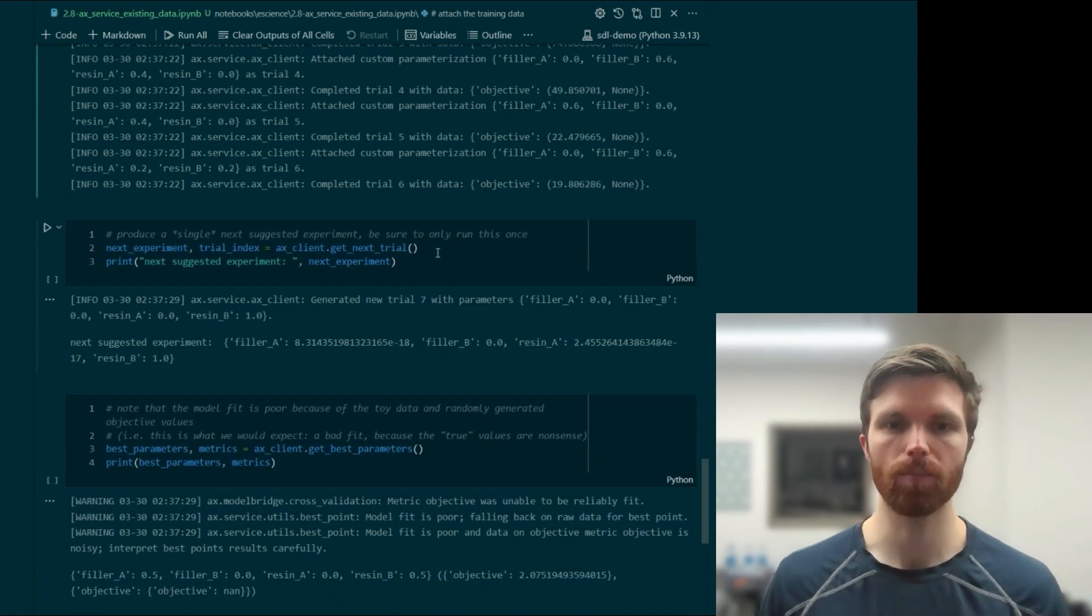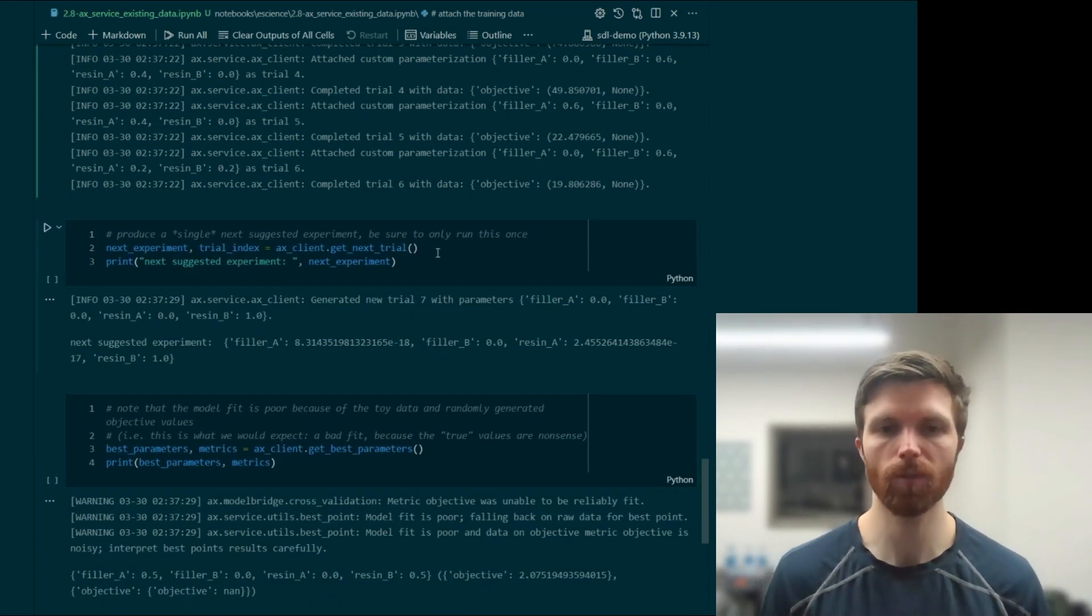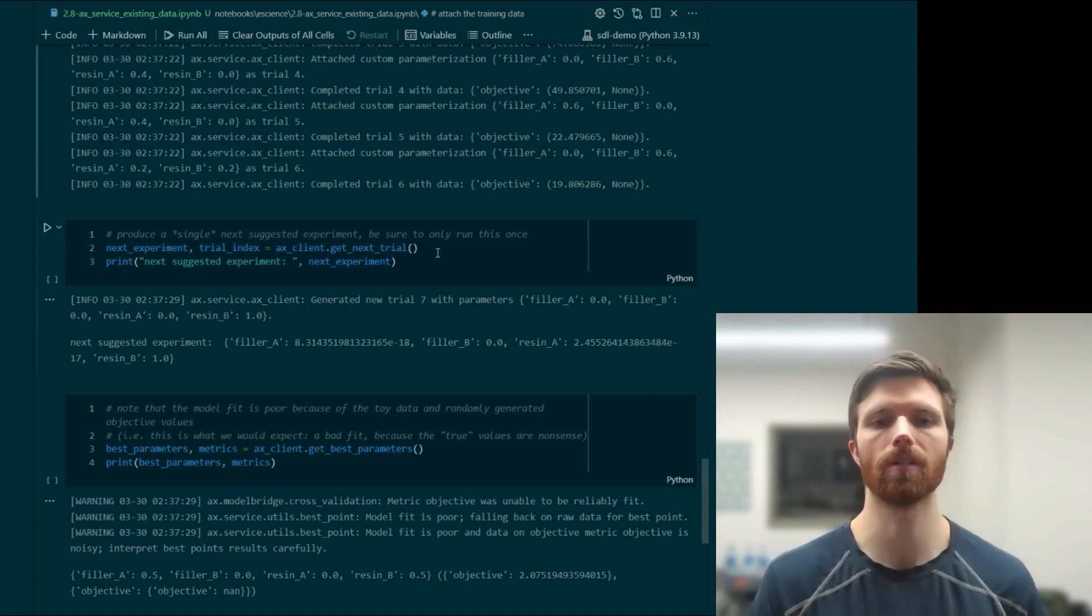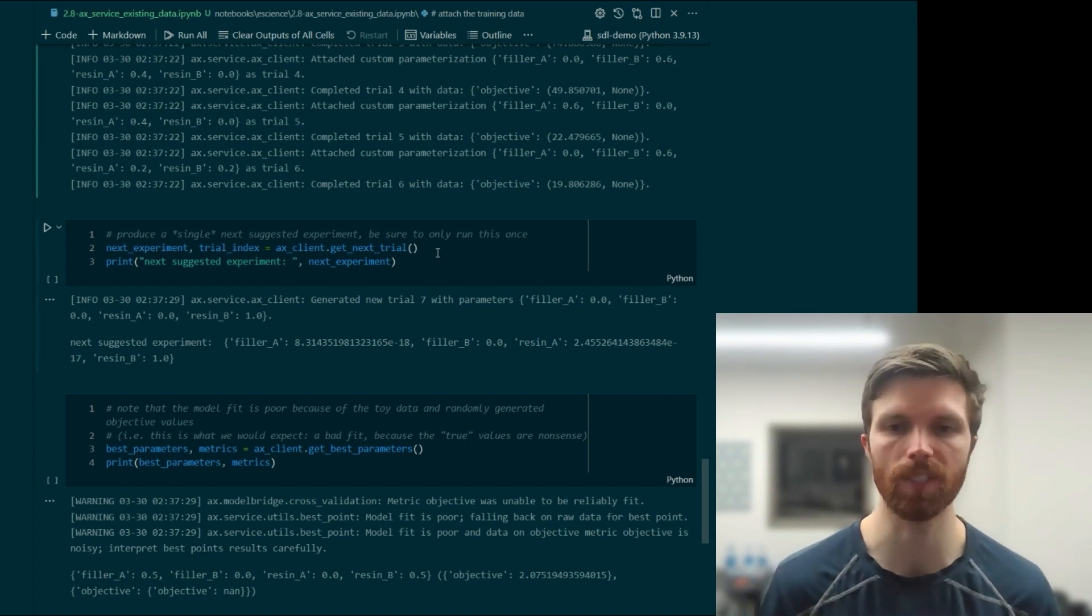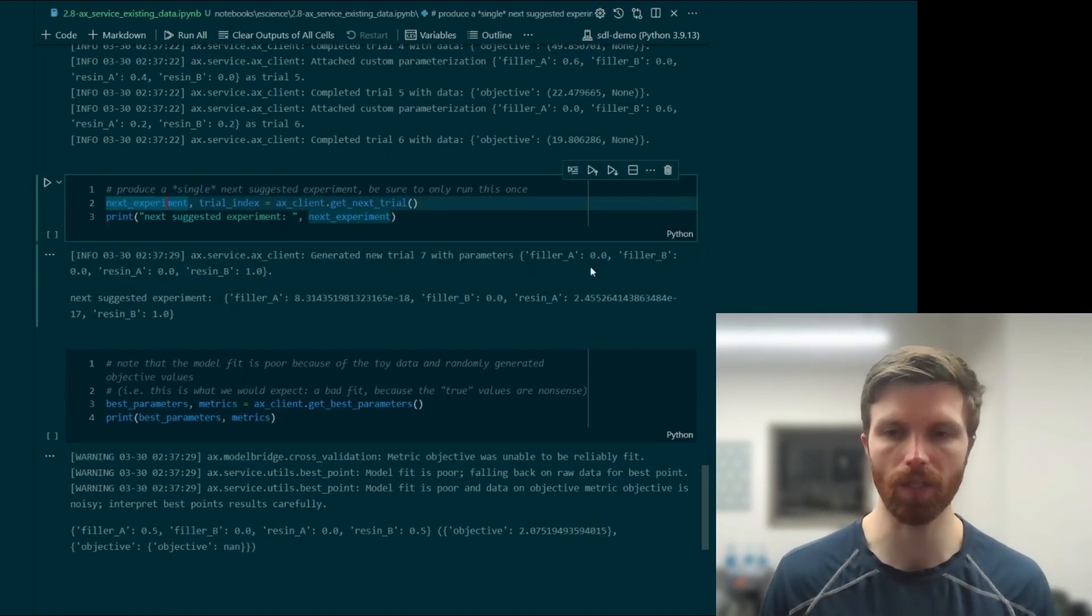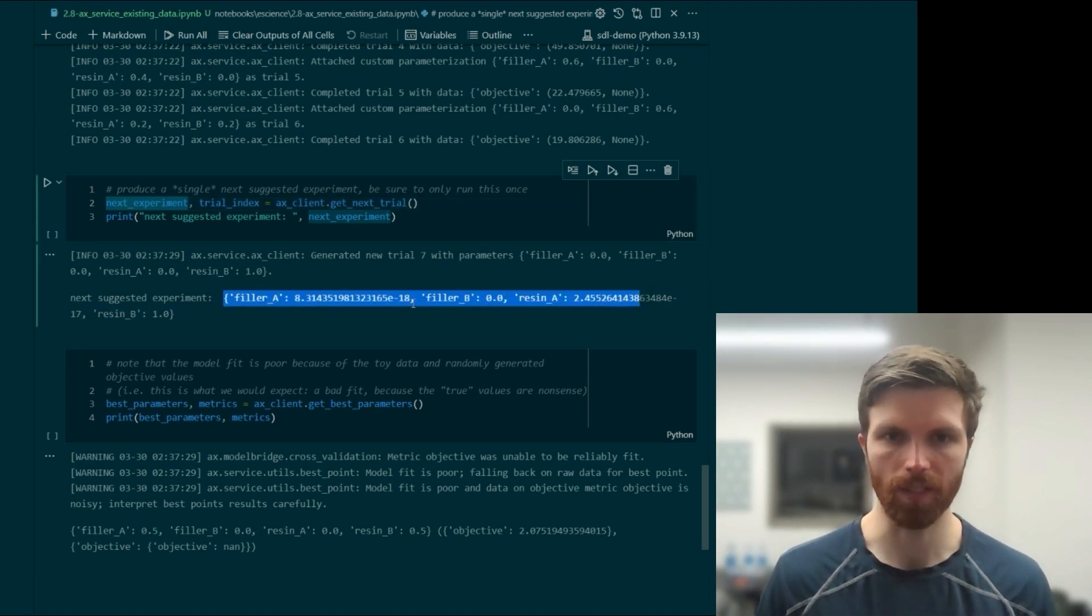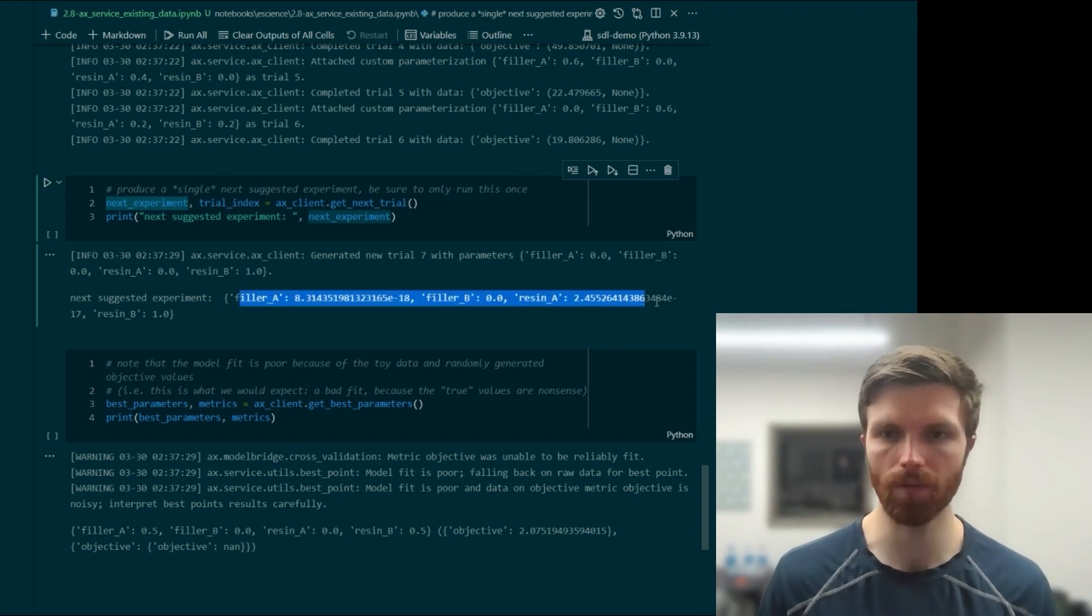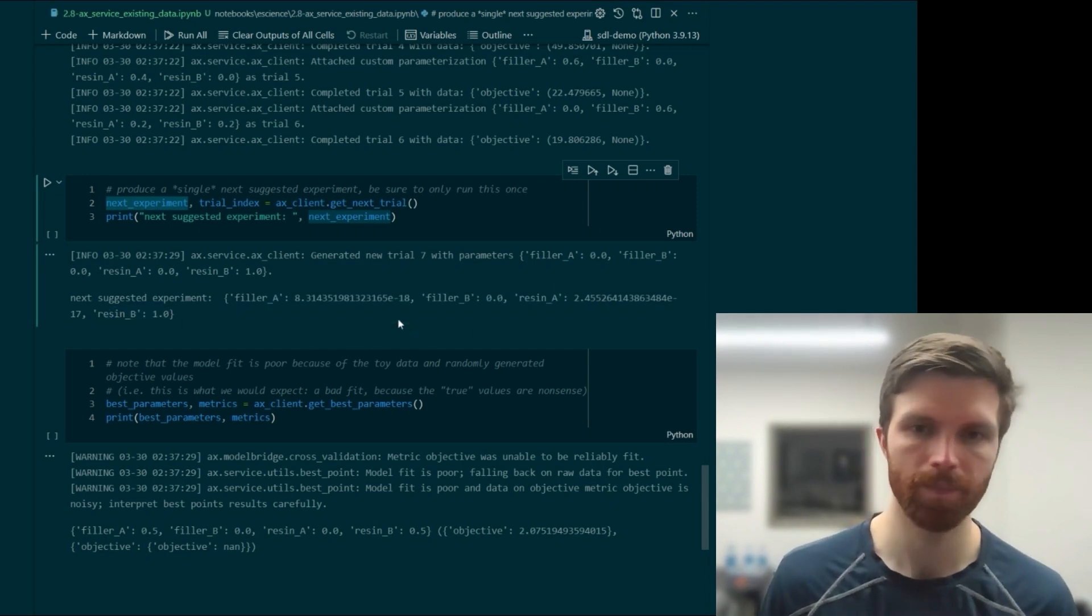Then we produce this single next suggested experiment. And this could also be a batch of experiments based on the tutorial given earlier on batch experimentation. So here we get our next experiment. We can take a look at what that is, where it's essentially putting filler A and filler B to zero, and then actually all three of these zero and then setting resin B to 1.0.